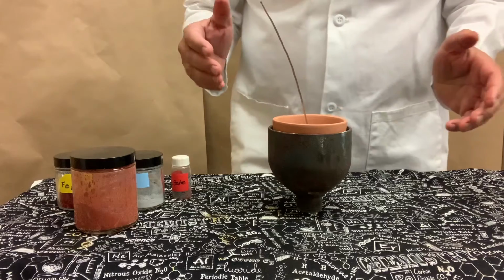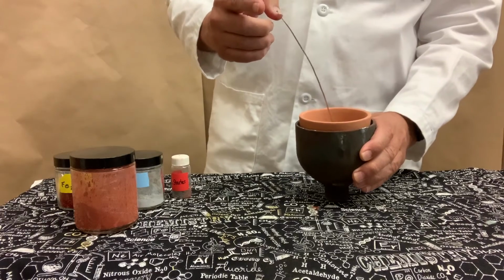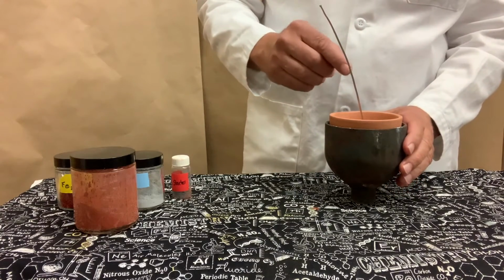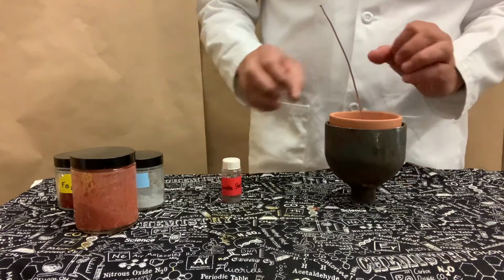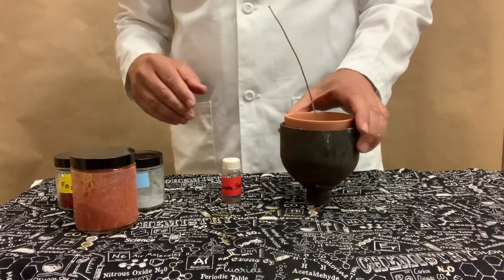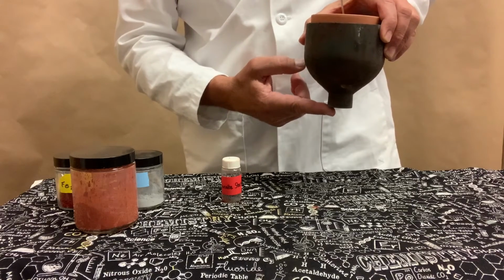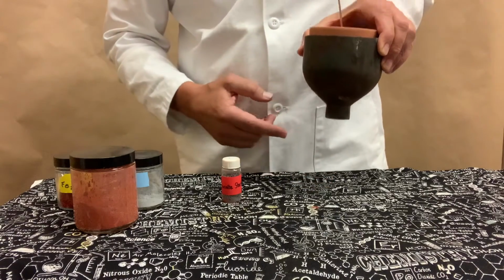When I go outdoors to perform this, this is what you'll see on the ring stand. I'll light the magnesium fuse with a propane torch. The fuse will burn down. It burns very brightly, but that's not the important part of this reaction. When it gets down to the thermite starter, you'll see a big flash at the top of the pot. But that's not really what you want to watch either. What you need to be paying attention to is this hole at the bottom, because the product mixture will be pouring out of here, molten iron and molten aluminum oxide.